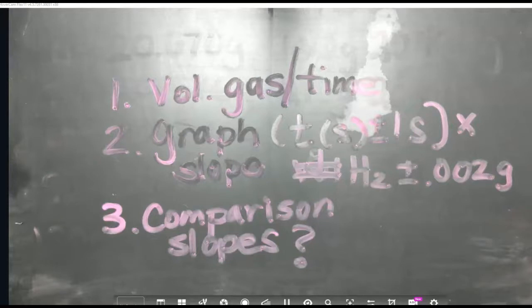You're going to determine a slope of the line tangent to each curve so that you can compare the slopes and those initial rates of reaction. Remember, we're looking for initial rates of reaction. So you're going to be using a line tangent to the beginning of the curve.